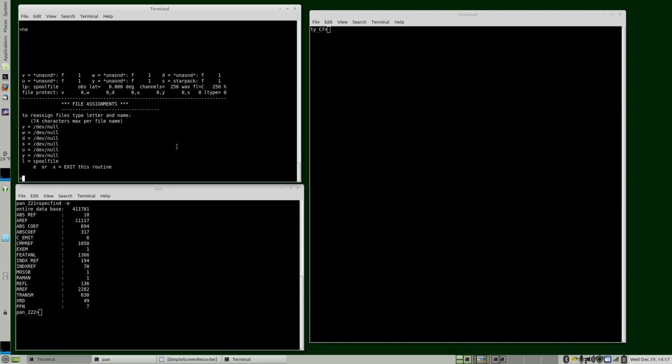Now we assign the individual files. Now what we want for this demo is I was going to install the USGS spectral libraries. So the USGS spectral libraries are located at, and I'm over in this rightmost window, SL1 USGS, and we can do the original or a convolved library.